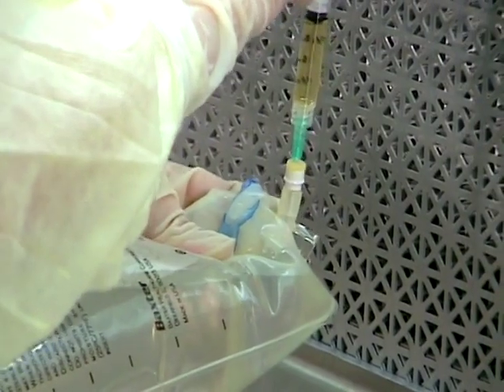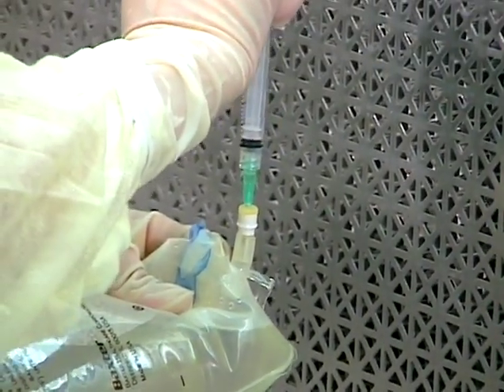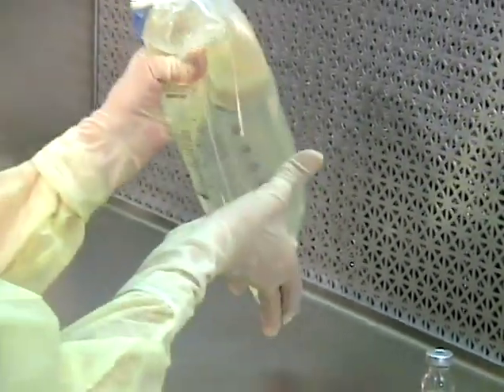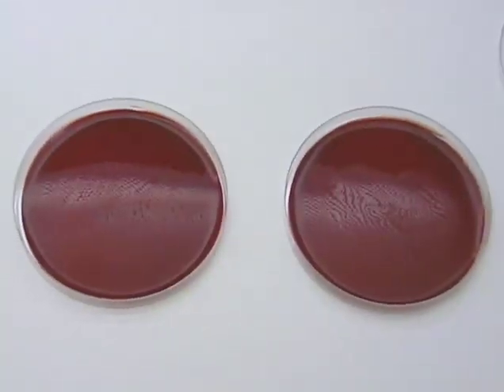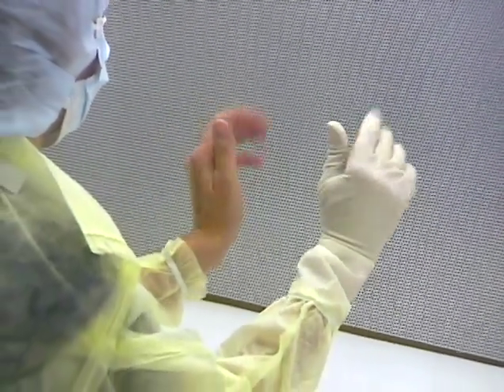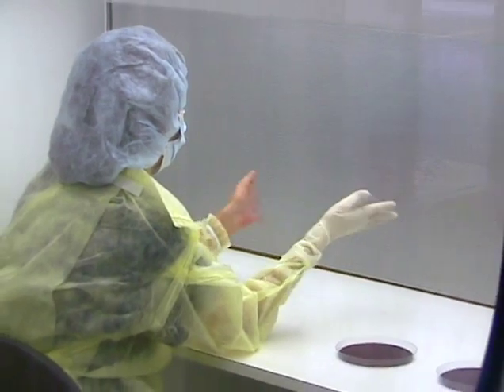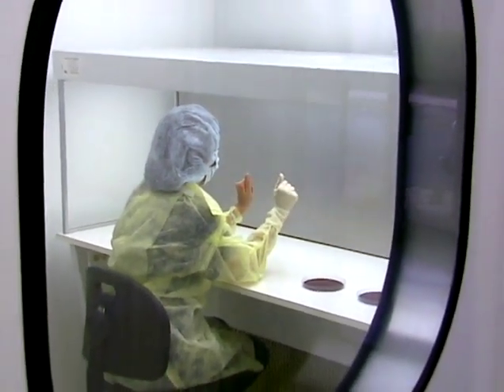While not sterile, gloves do provide a renewable bacteriostatic barrier as compared to the bare hands, and are used to completely contain microorganisms and skin particles which shed profusely from the hands during the compounding process. This is easily illustrated by a comparison of contamination levels present on the gloved hand versus the bare hand. In this demonstration, both hands were kept in first air for 30 minutes after washing.